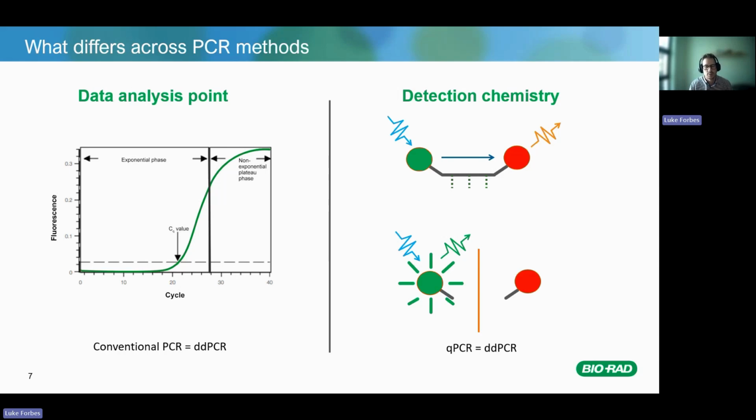So in conventional PCR, we have no fluorescent dyes to monitor the reaction. Hence, you run a gel at the end of your reaction to determine the presence or absence. However, in both real-time PCR and in the Droplet Digital PCR, we make use of these fluorescent dyes that can monitor your reaction in real time, and ultimately they're useful in determining quantity.